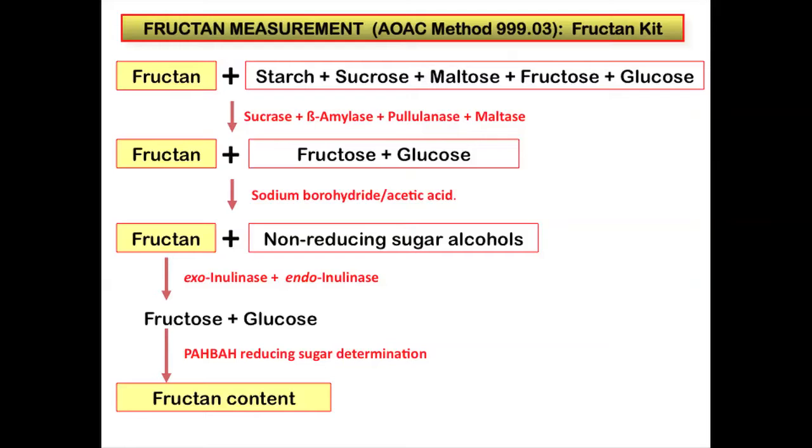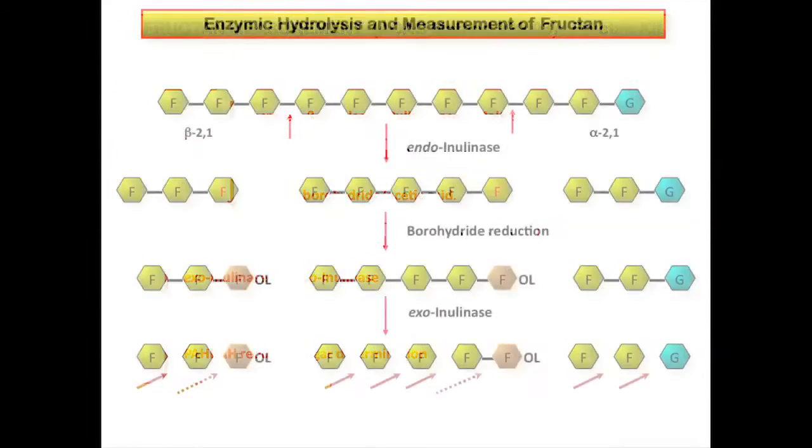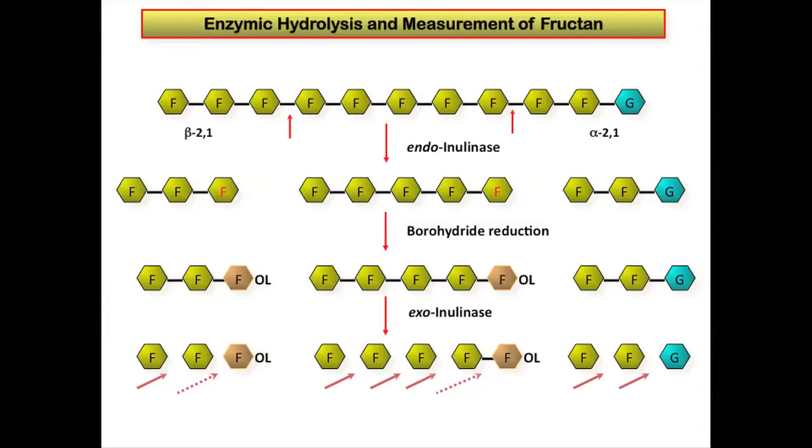These are then measured with the PAHBAH reducing sugar method to give the fructan content. A problem in applying AOAC method 999.03 to the measurement of fructan for partially degraded fructan samples is shown in this slide. In hydrolyzing the fructan to oligosaccharides with endoinulinase, reducing end groups are exposed. These reducing end groups will be reduced to sugar alcohols by borohydride in the borohydride reduction step in the assay procedure.